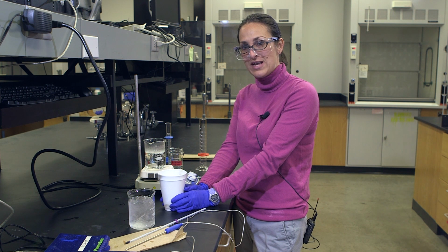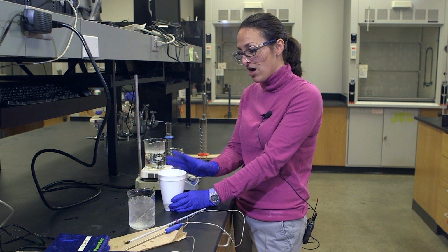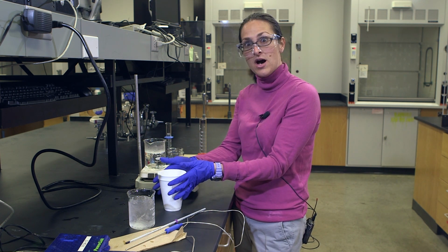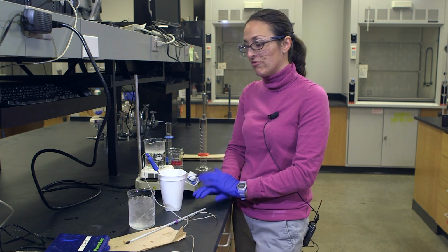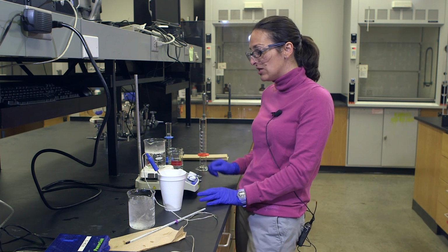Styrofoam cup works great because it's an insulator. It's really effective. So any temperature changes are going to be mostly in the solution, in the liquid, and not due to outside interactions. So I'm going to use my temperature probe. I want to measure the water temperature before I add anything because I'm measuring a change in temperature. So that's my initial temperature.